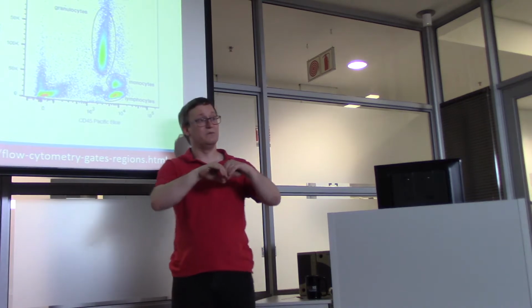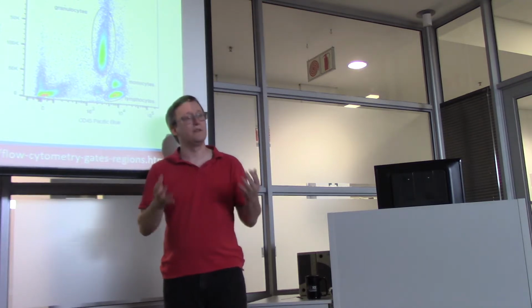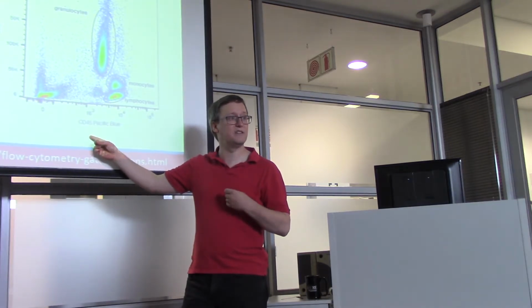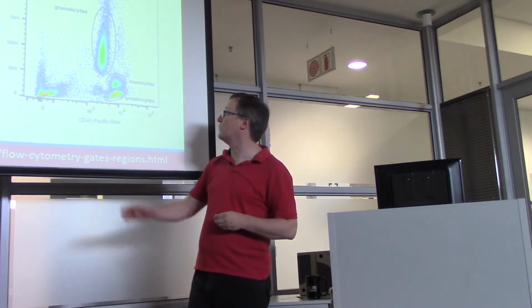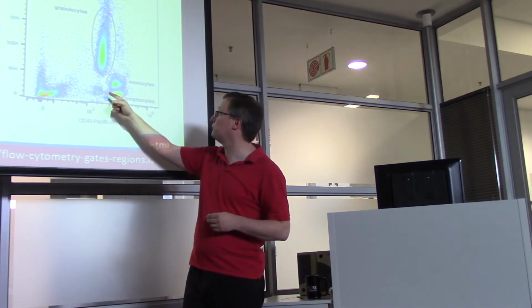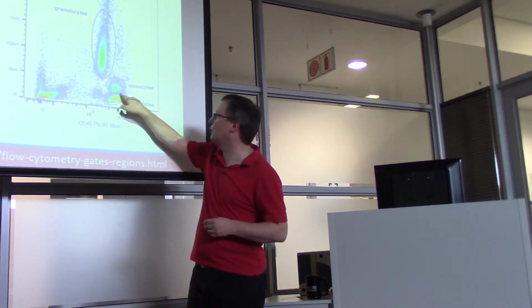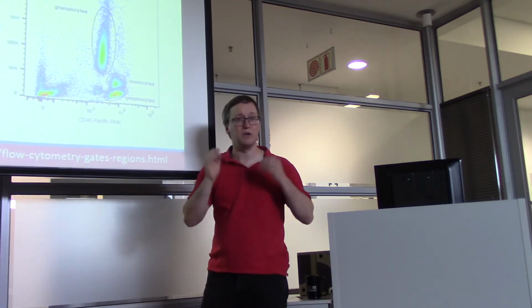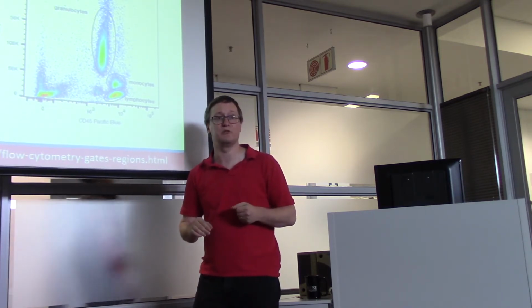So if you are trying to parse apart all of these different cell components of a mixture, the flow cytometry data is giving you the ability to differentiate them, in many cases based on things that are specific to an antigen you really care about. So gating, in this case, is going to mean that the person using this software is going to specify rules that say anything that falls within this oval but not within that oval shall be called a lymphocyte. Anything that's found inside this oval but not that one can be called a monocyte. These rules are the gating strategy for interpreting flow cytometry data.